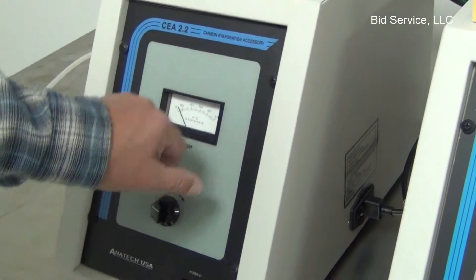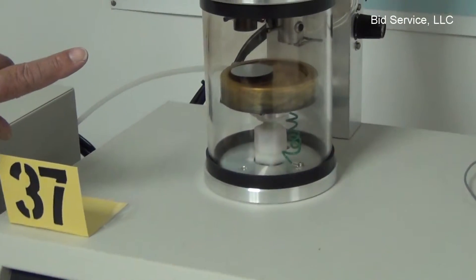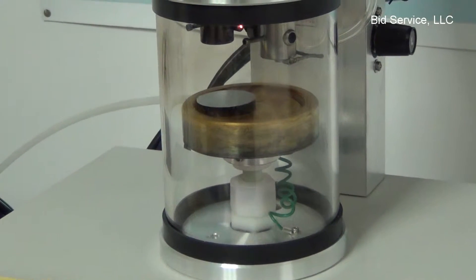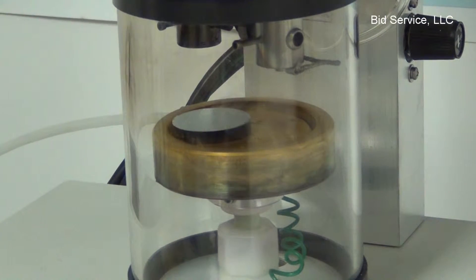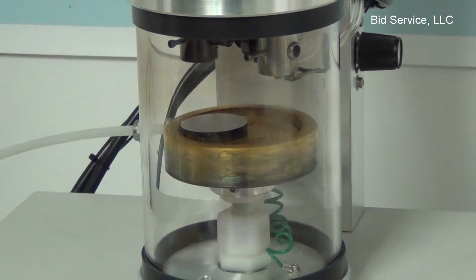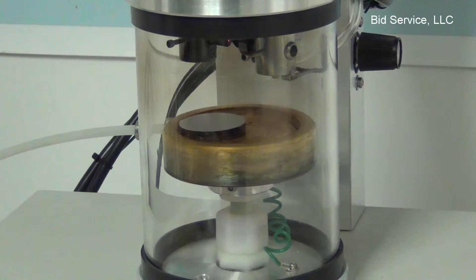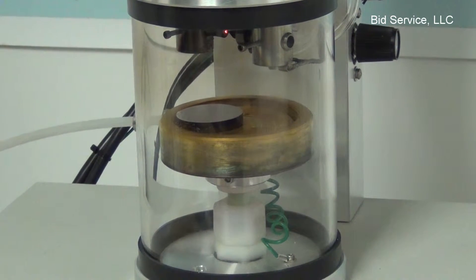I'm going to increase the current to about 5 amps. And there's a small glow in the chamber on the carbon rod. You want to go through a heating process of turning it off and on a couple of times, and you're doing that to warm up the carbon rod.